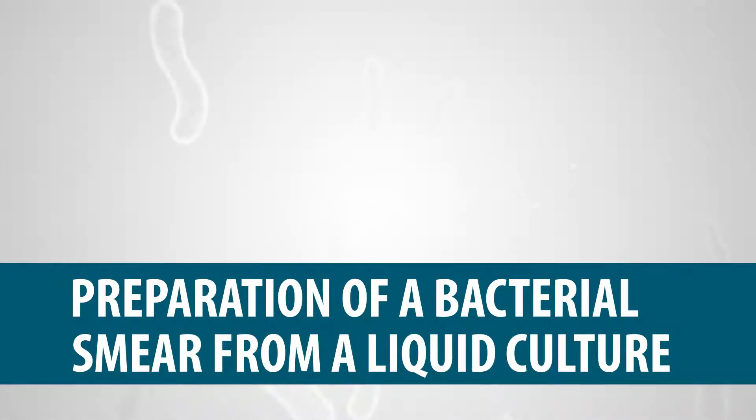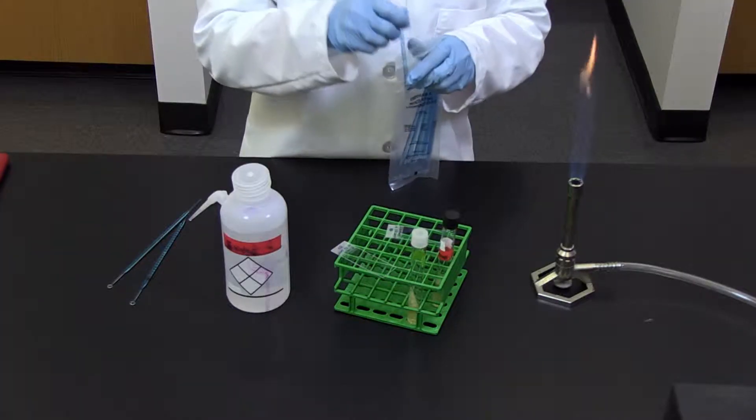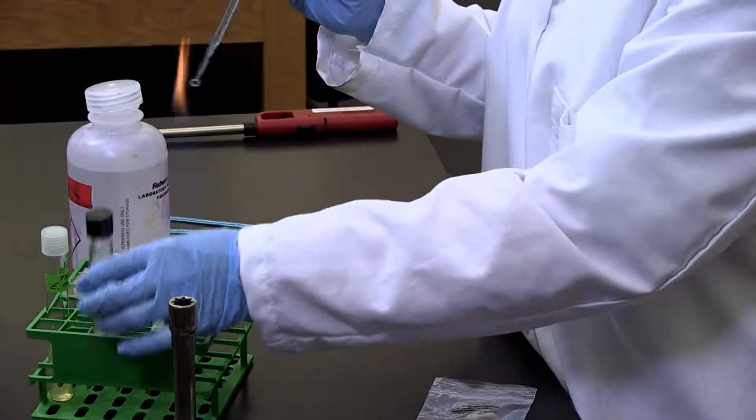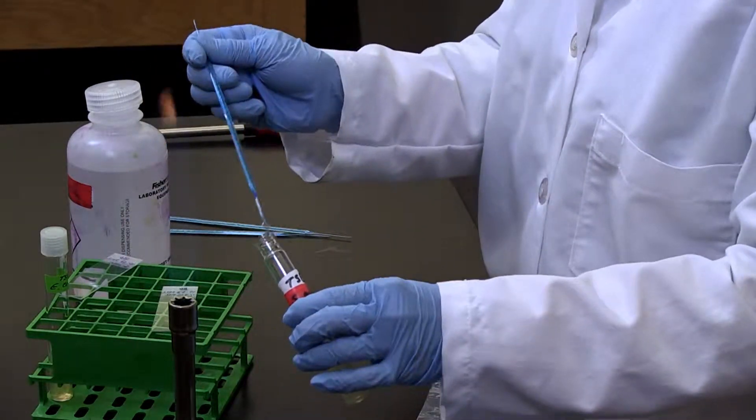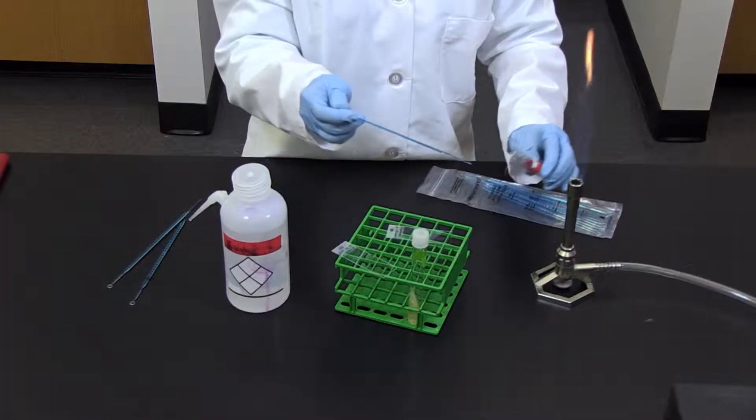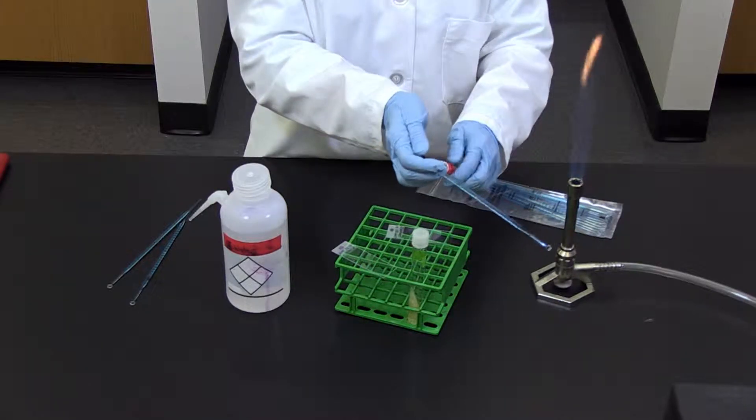Preparation of a Bacterial Smear from a Liquid Culture. Just as previously done, label a clean microscopic slide with the bacterial species name used in this exercise, today's date, and your initials.